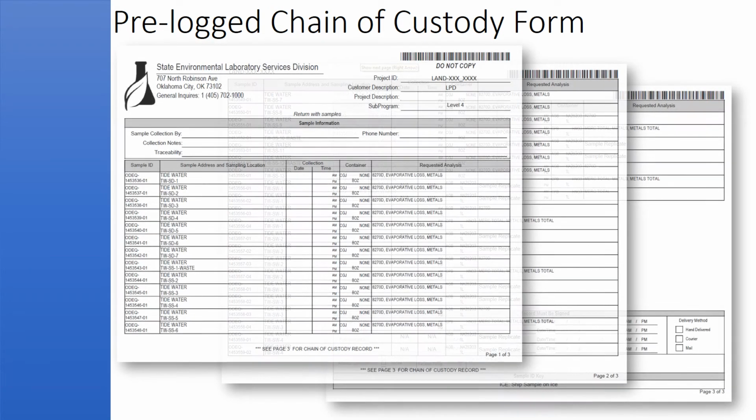If you know the contact information for the customer or person who will receive the lab report, the scope or nature of the sampling event, how many sample sites and the testing requested, the lab can log your samples ahead of time and provide partially completed paperwork. If you know your sample address or site info, we can populate that as well, but it is not required to prelog samples. Prelogging provides enhanced traceability since each test and sample container is already present on the form.